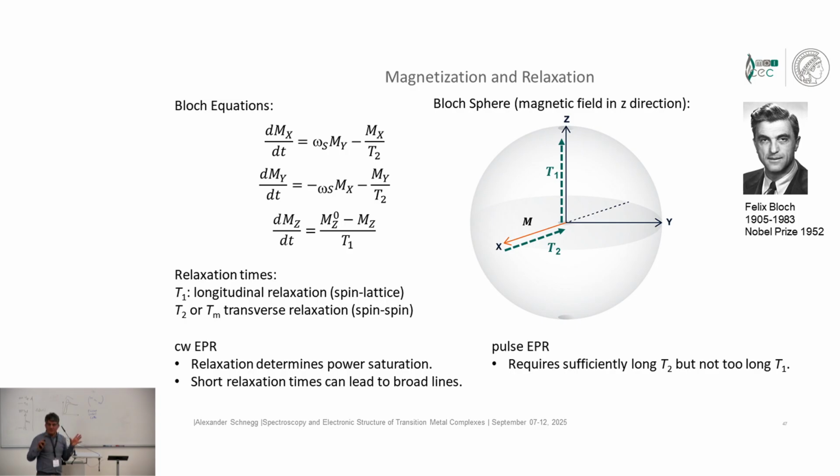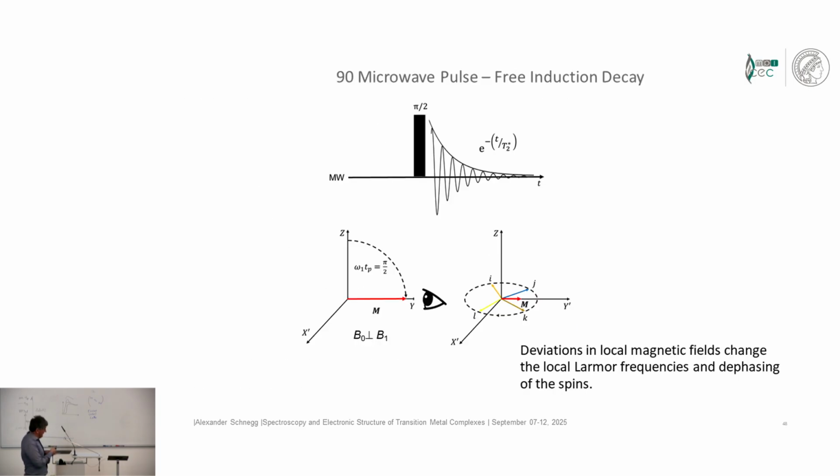I understand that this is a picture change. If you have questions, please ask me at the end of this 20 minutes, but moving our magnetization is now necessary to understand what our pulse experiment is doing, and I hope I can show this here by again referring to free induction decays.